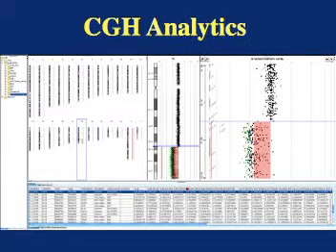This is a software display of the microarray data. We can see if there are copy number changes anywhere in the genome from the panel on the left. Changes are indicated by the pink bar. We can zoom in on any single chromosome, shown in the center panel. And we can zoom in on any region of an individual chromosome, shown in the panel on the right.